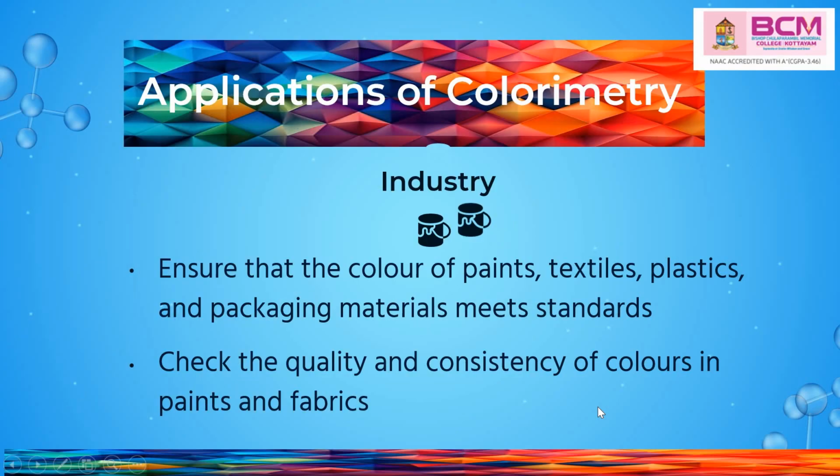In industry, colorimetry can be applied to ensure that the color of paints, textiles, plastics, and packaging materials meets standards. It can be used to check the quality and consistency of colors in paints and fabrics.